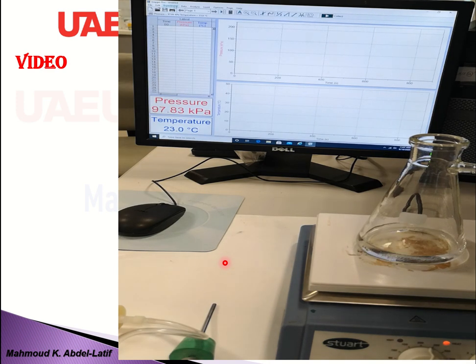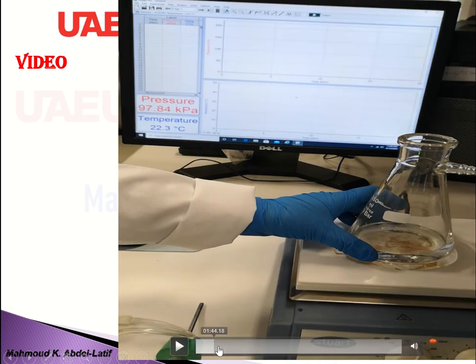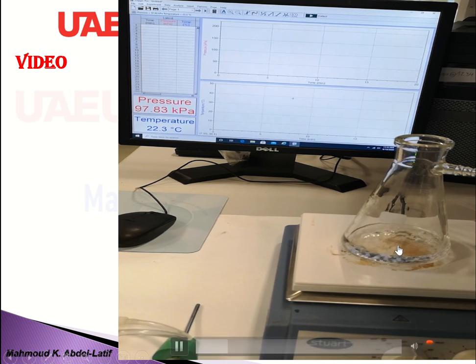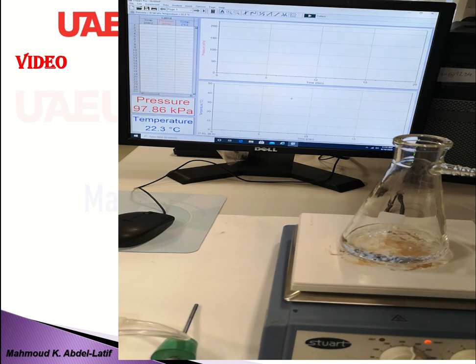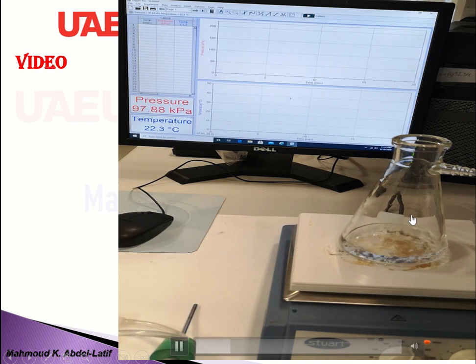We can accelerate it a little bit. Just let it boil for 2 minutes, so to say, in order for the space above the surface to be filled with the vapor, to be saturated with the vapor.